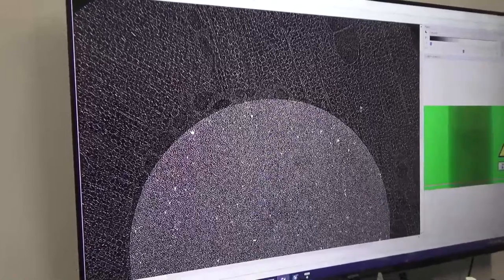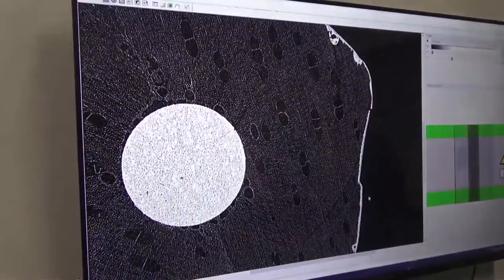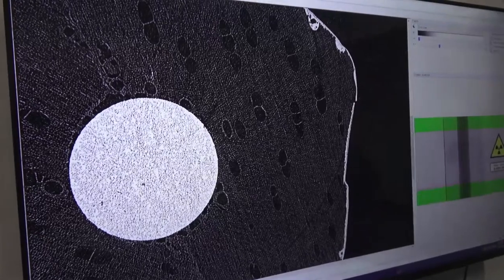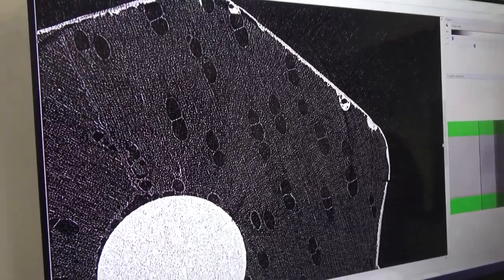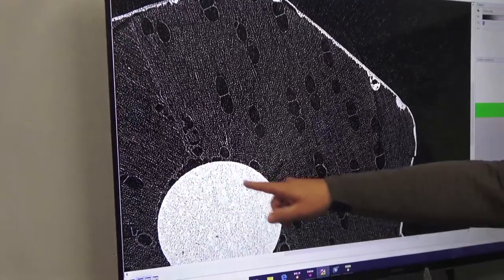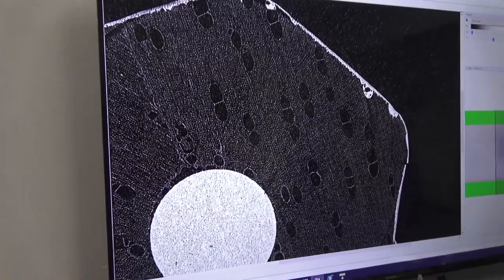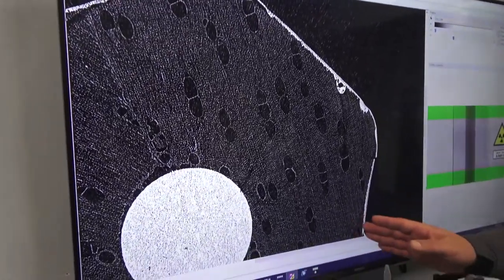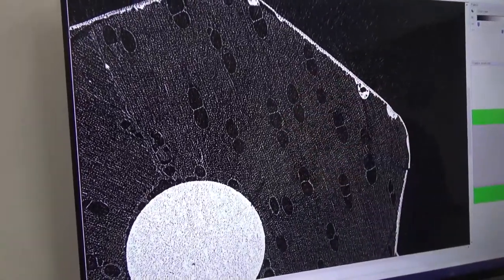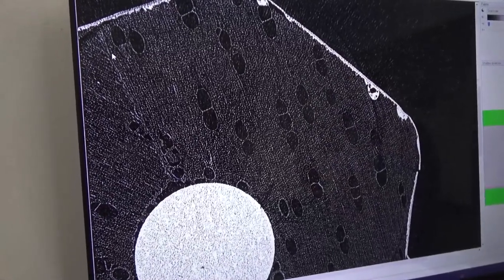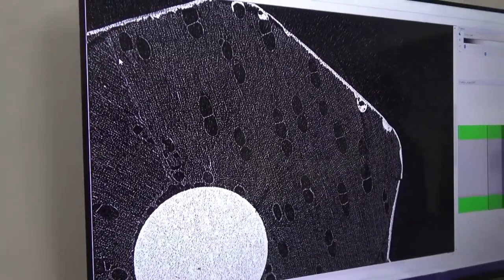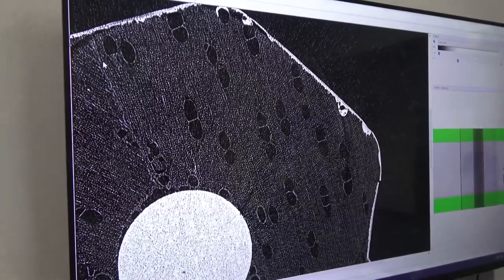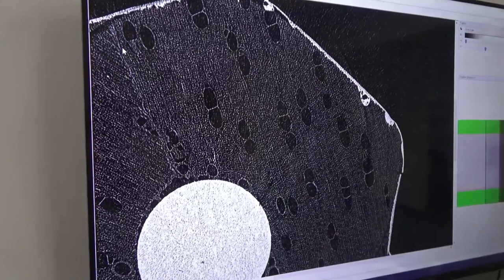It's a real benefit to have access to different length scales depending on the question you're trying to ask. If you're looking at how well the paint coating adheres, that's one length scale. If you want to study the wood core structure, you need higher resolution. At one micron we can see cracks in the paint, how wood porosity has affected the paint filling into pores, the grain structure of the wood going in different directions, and even the glue line between the two halves of the pencil. Sometimes you don't always want the highest resolution — you want the resolution that gives you the data you need the quickest.